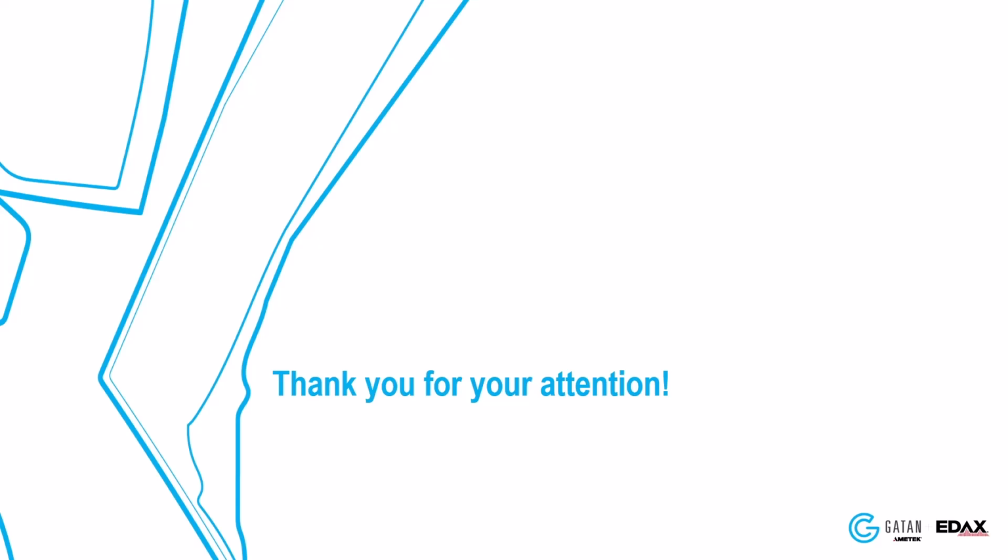Okay, no problem. So when the WDS is installed, our service technician will perform an energy calibration of all crystals. We'll also calibrate the optics to be placed in the optimal spot. And we'll also do a broad calibration of, for example, the HV, as I mentioned in the talk. What's important for the user to do regularly is especially the HV calibration once you start to use a new element that has not been optimized prior to that acquisition.